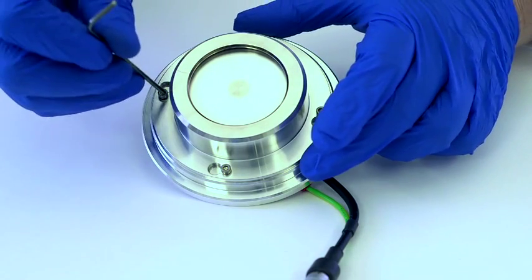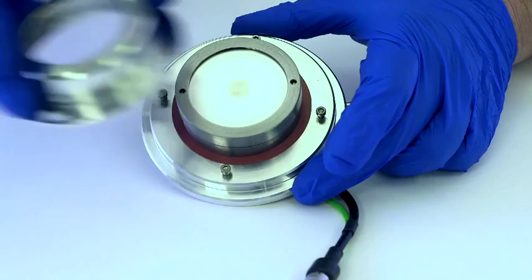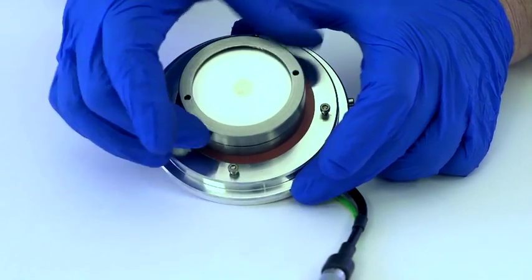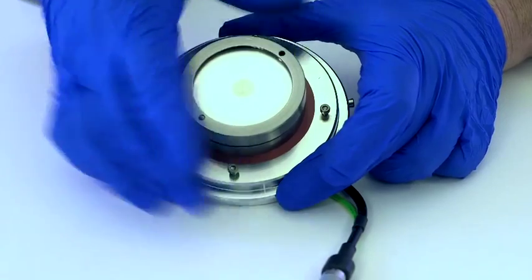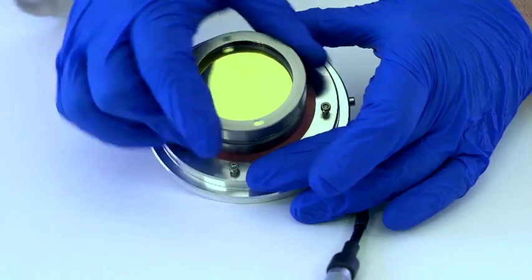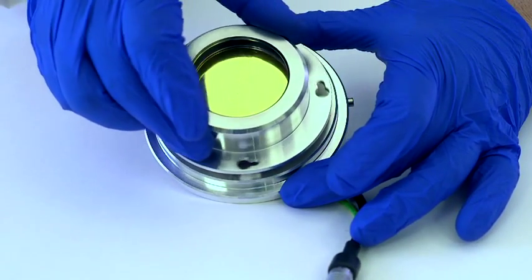The Q150TES is fitted with a sputter insert and a chromium target as standard, but is capable of sputtering a full range of oxidising and noble metal targets to meet the most exacting requirements, from routine gold coating to high-resolution chromium or iridium coatings required by today's high-performance field emission electron microscopes.